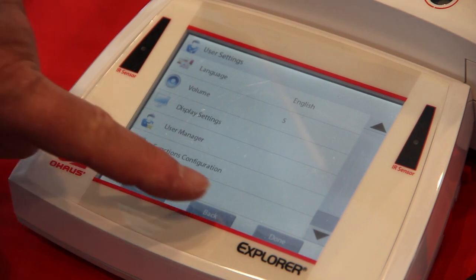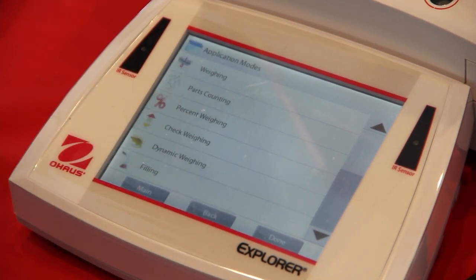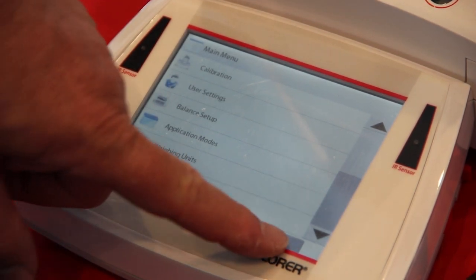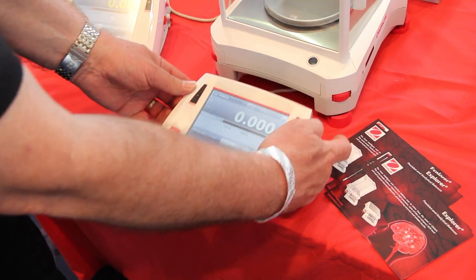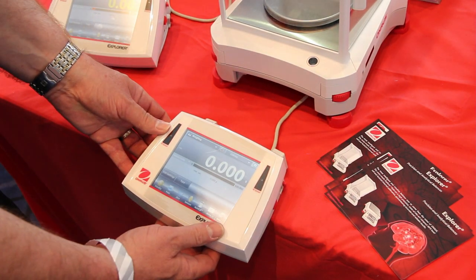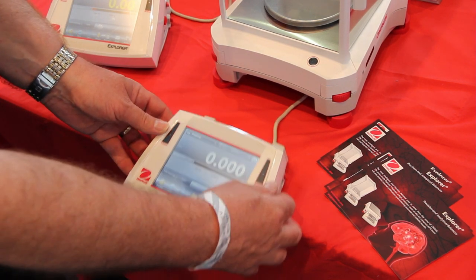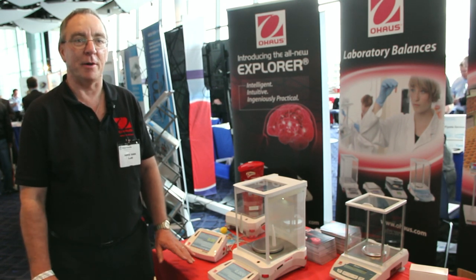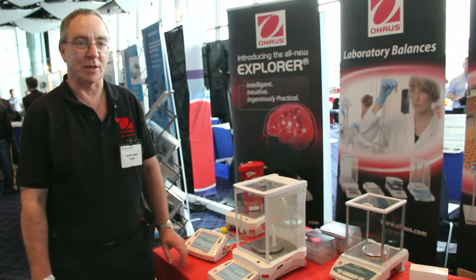The innovative thing about this product from our point of view is that it's the first colour touchscreen balance available from O-House, with some additional nice features on top of that, which include a remote display which you can move away from the weighing chamber. There's a backlight in the analytical and three-place versions, and on top of that four infrared sensors allowing you to do some basic functions with the balance without even touching it.